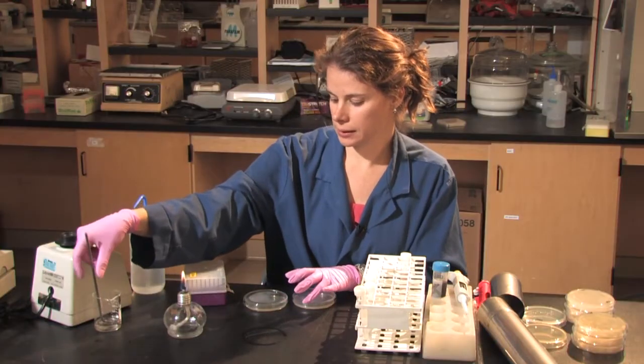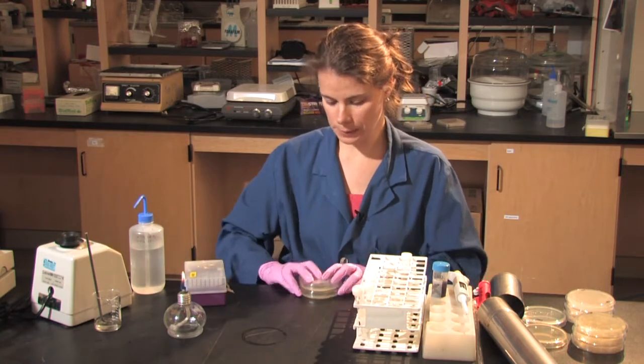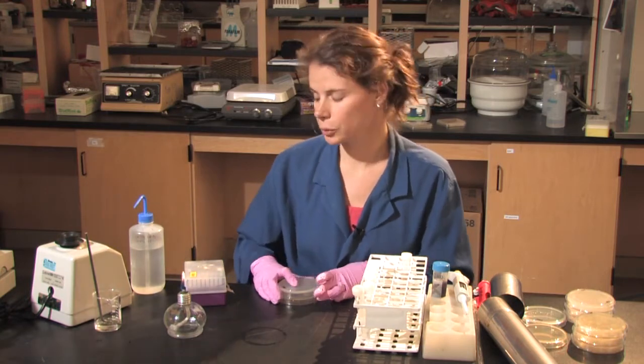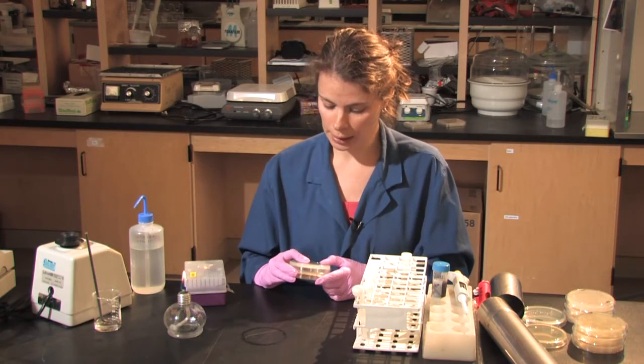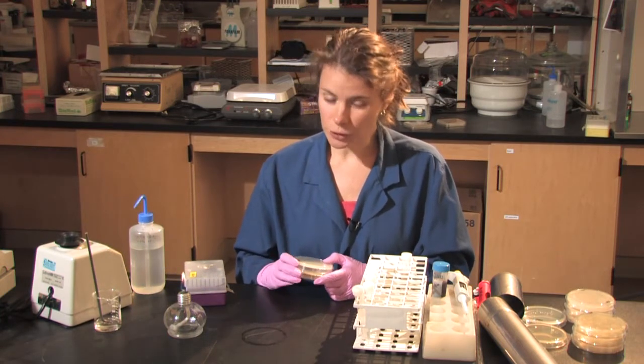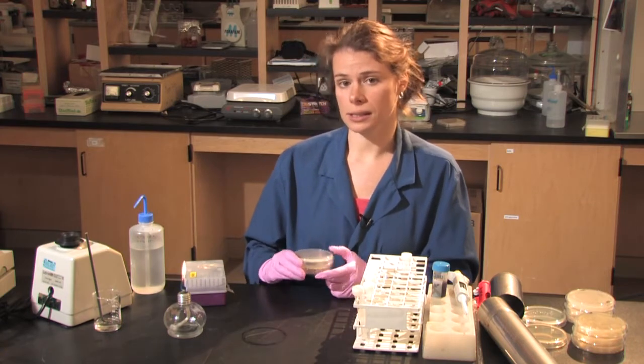Once the solution is spread evenly, I will flip the plates so as not to get any moisture on them, and put them in a 20 degree incubator or at room temperature. I will leave them there for a few days, and this will allow the colonies to grow.